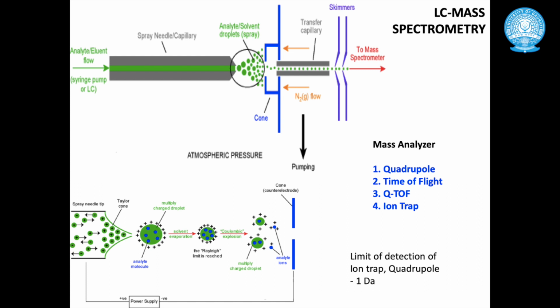Once it enters, there is a capillary, written in black text as spray needle or capillary.